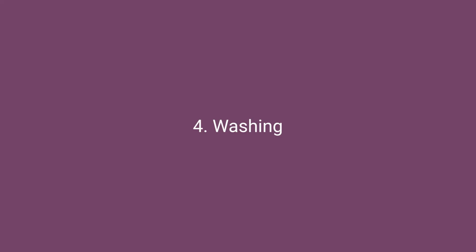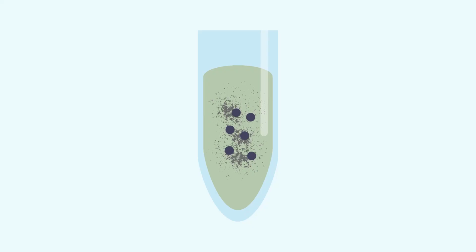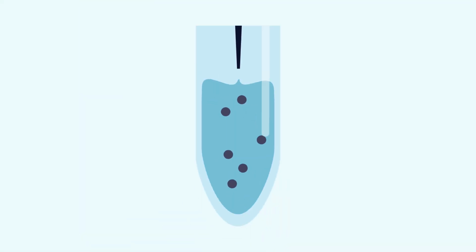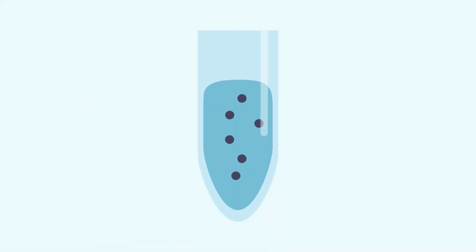If you find that the absorbance ratios of your samples decrease while optimizing the washing stage, that's a sign impurities weren't fully washed away. Your method will likely involve several washes. The first is the most challenging and most important to optimize. There are many proteins in the sample at this point. These proteins can cause the beads to aggregate and trap impurities. The magnetic particles must be fully resuspended to release and wash away these impurities.